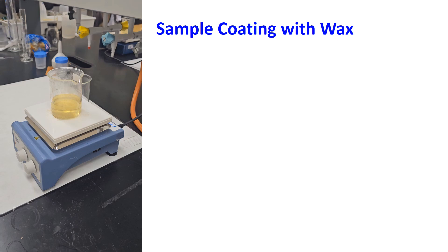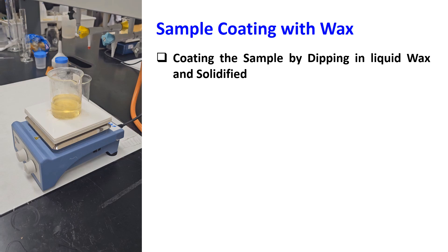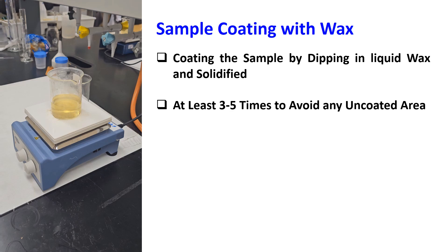We are now coating the sample by dipping in liquid wax and solidifying. Coating the sample by dipping in liquid wax and then solidifying. Coating should be done at least 3 to 5 times to avoid any uncoated area. After each dipping, we need to wait for the wax to solidify on the surface. Temperature of wax should be maintained at an optimum level during coating.